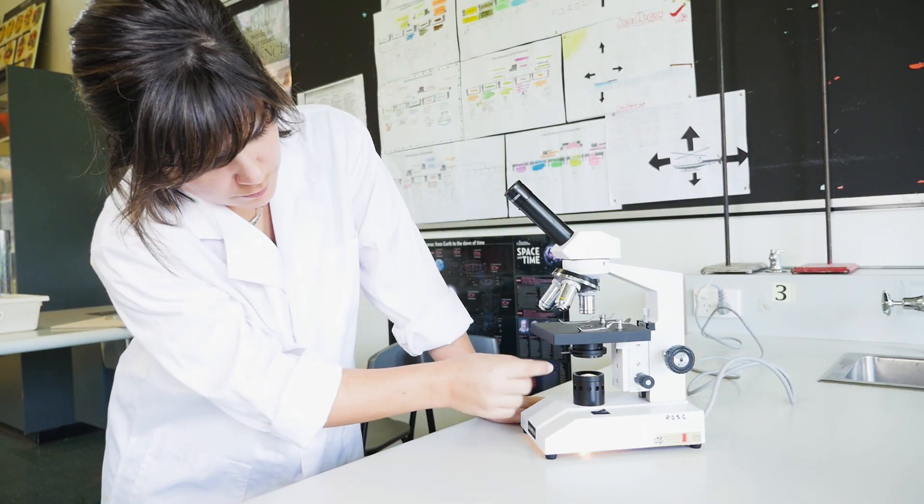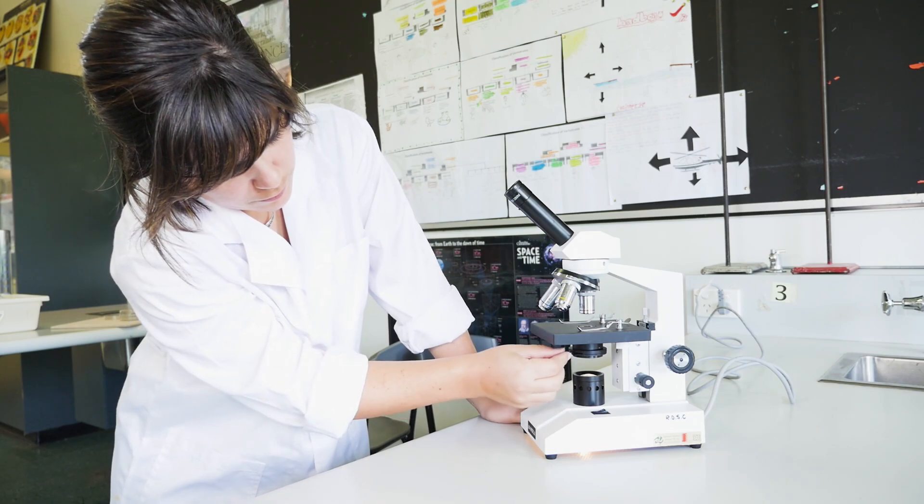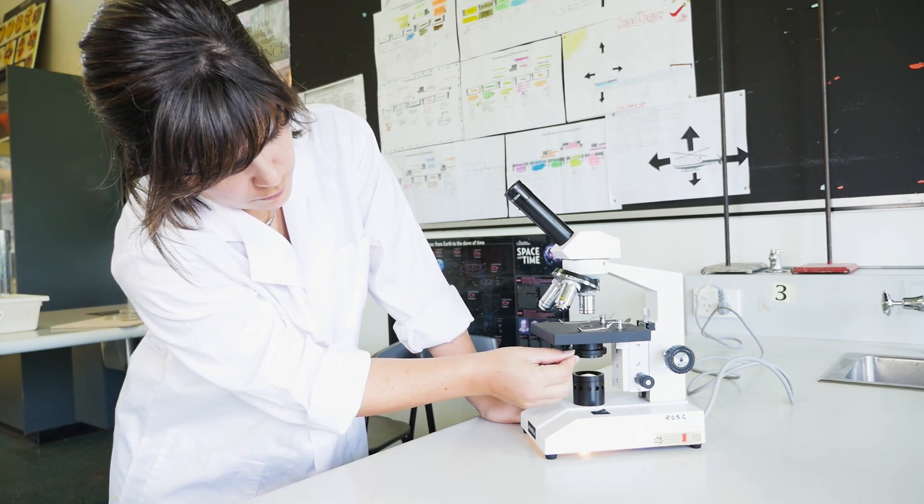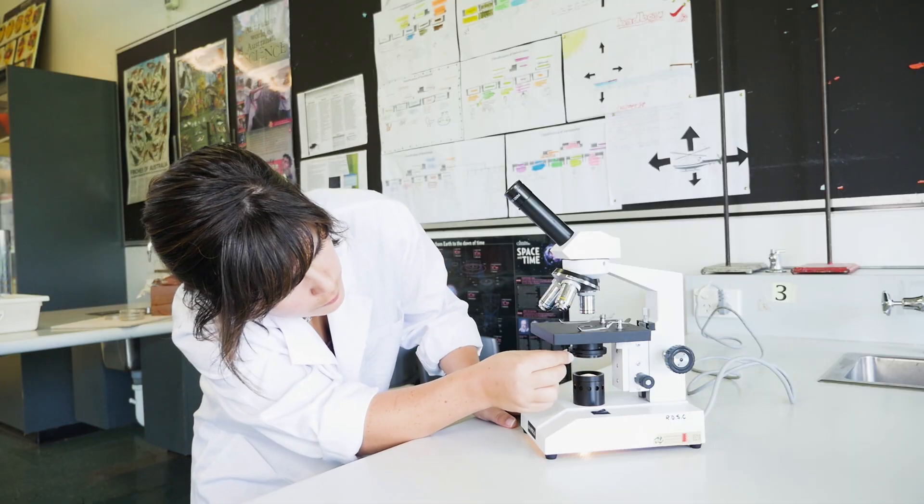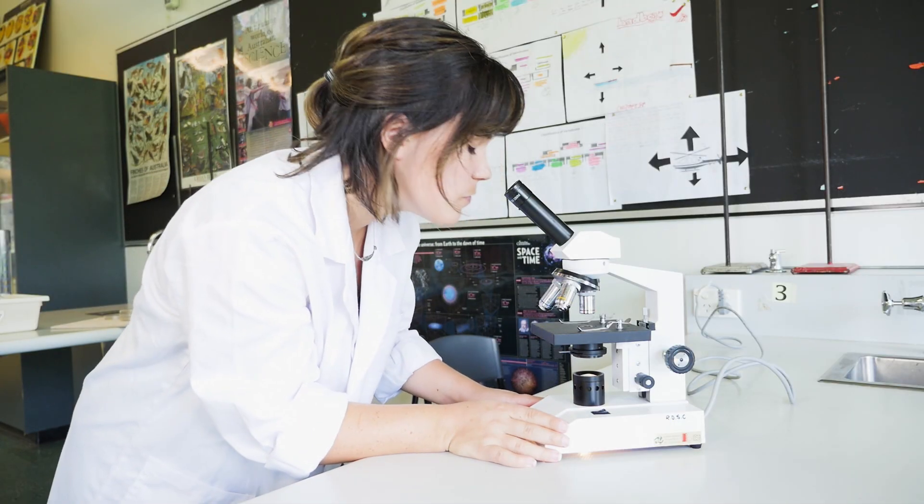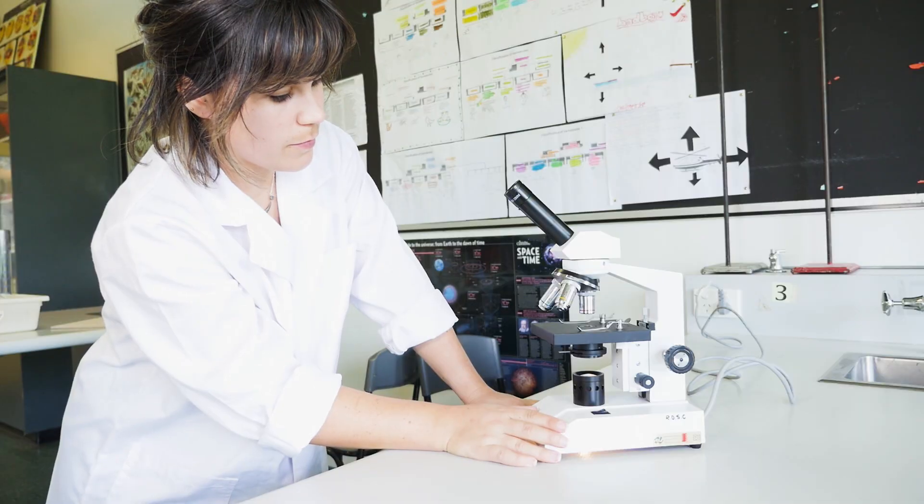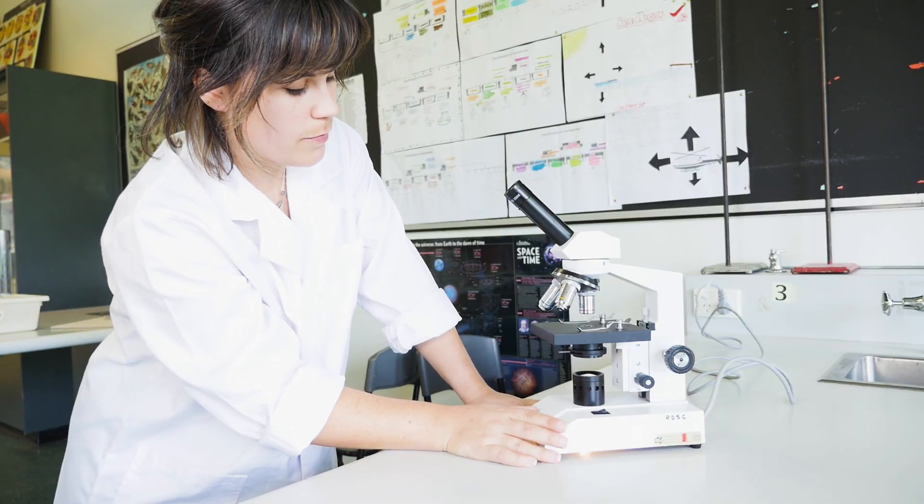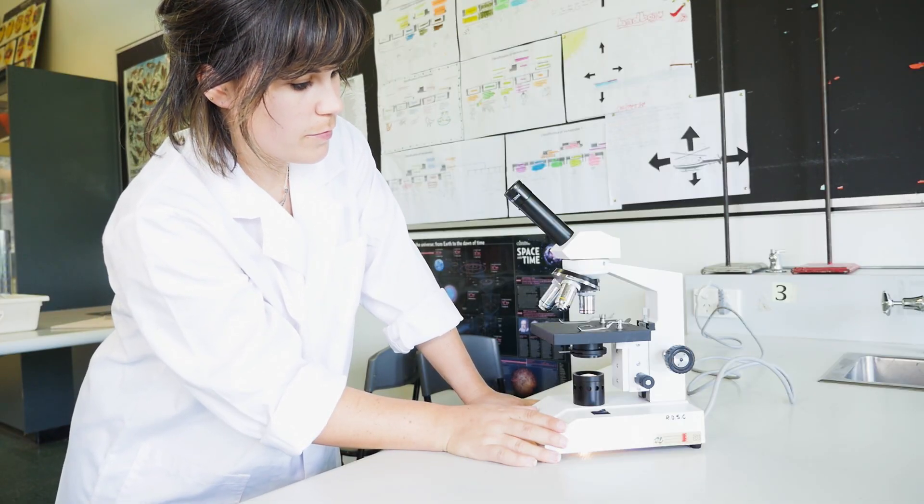Here's the diaphragm. Opening it lets more light in and closing it will make the image darker. Use the lever to adjust it so that a medium amount of light passes through the hole in the stage. You can readjust the light later to improve the image. Remember, the brightest light doesn't necessarily give the best image.